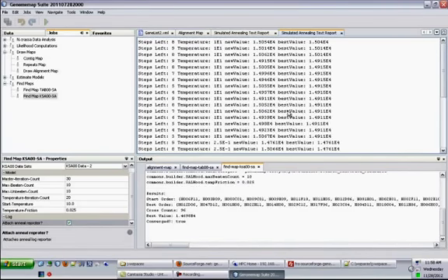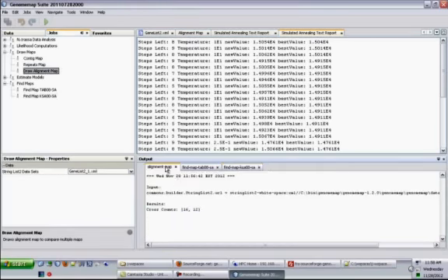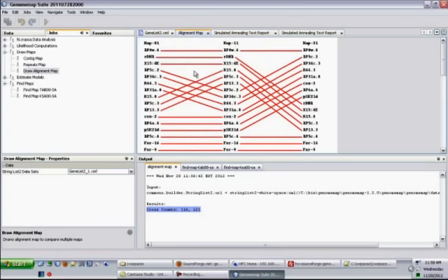Here you can see. So basically, you get to choose whether you want to see the log or not, you can turn it on and off. The start order, the base order, and the number of cross counts. Here we see it did change the start order, and we have 96 cross counts. That's about it. Again, for the alignment maps, you also get to see the cross counts between these two maps. So between these two maps we have 16, and between these two we have 12.